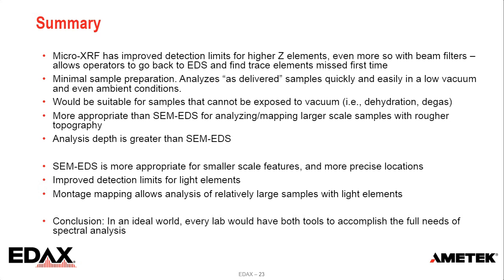So in conclusion, in an ideal world, every lab would have both tools to accomplish the full needs of spectral analysis. We can use Micro-XRF to give us high sensitivity for higher Z elements, and on the low energy light element side, we can use EDS to do the job.